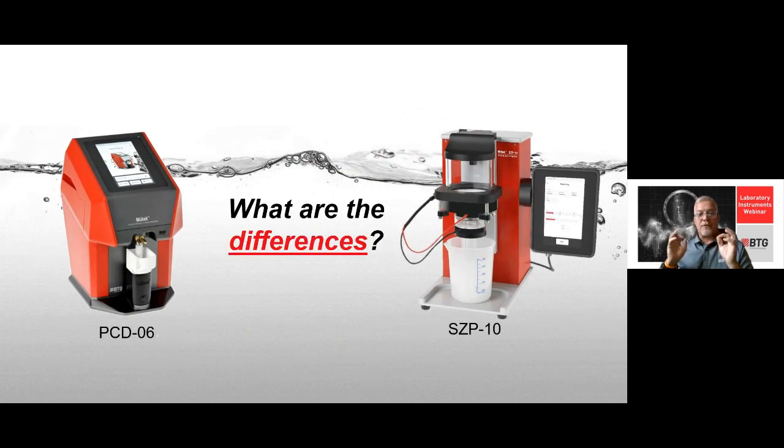So, electric charge. We talked about measuring charge and looking at system charge and electrical interactions. These two devices are the ones that are going to really shine the light into your process that allows you to understand what's happening and answer a few of those questions that you're looking at, like, what's my charge window? Am I getting on the fibers? But in order to do that, we need to introduce what each one of these devices is doing and how they tell their part of that story.